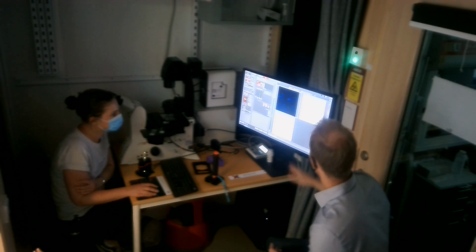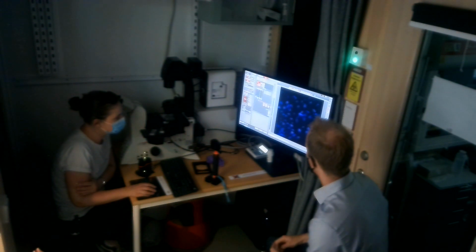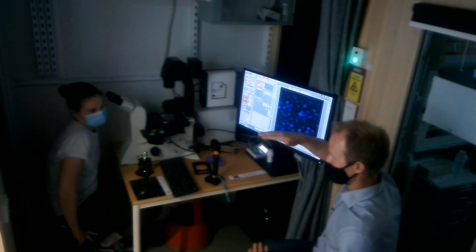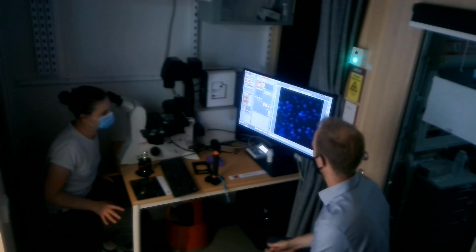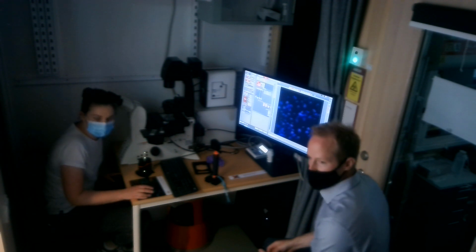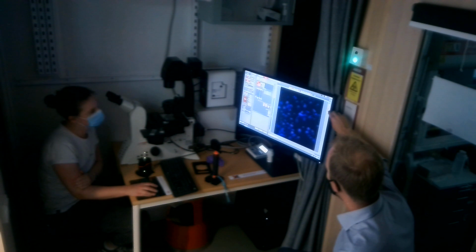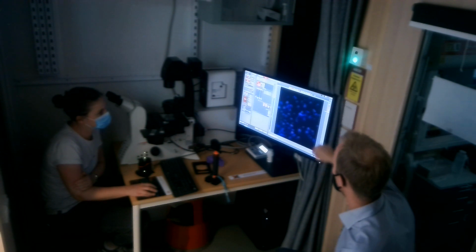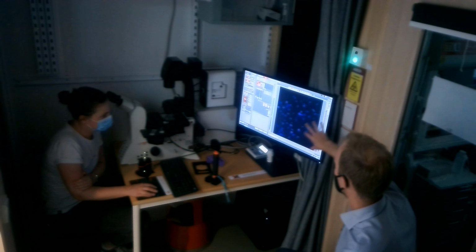Brightfield sometimes looks a bit weird, but if you look at the fluorescence, this is what would typically be. If you have stuff that is in different levels, this is a way to collapse them down to one. And then it will create another image, right? No, the maximum intensity, when you click on this one, is just doing that on the viewer. So this is not saved at all. If you click that again, you're back to this. Okay, so this one is only doing it for the viewer.